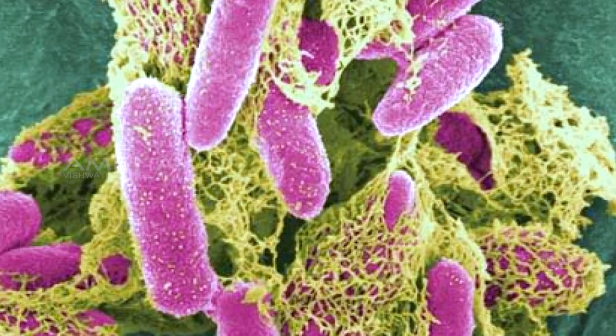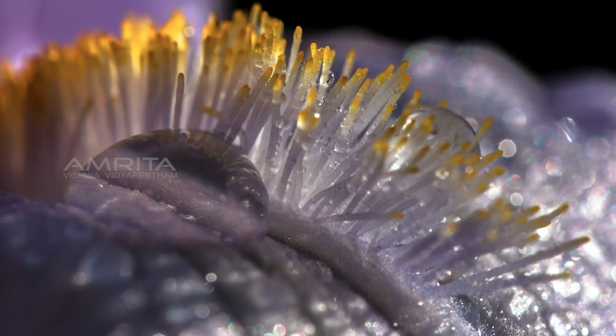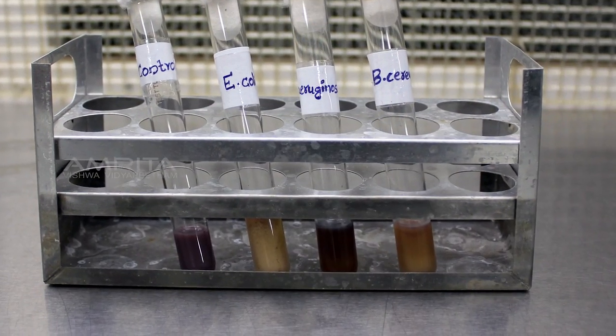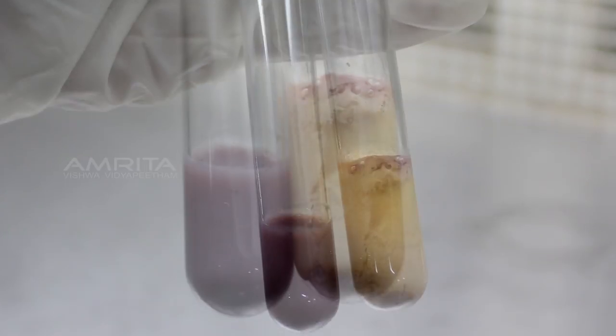Depending on the types of enzymes produced by different organisms, a variety of different chemical changes happen in the medium.